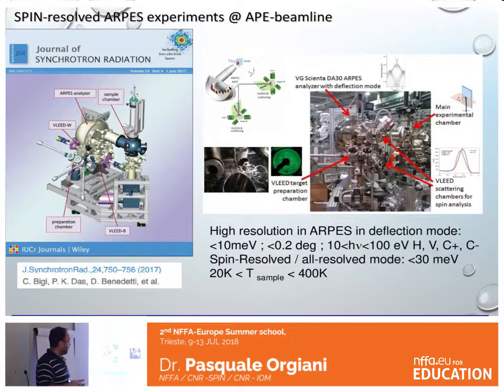So, but what about the surface state? So this is the bulk, so it's in the film. But what is the situation at the surface? To do that, we use ARPES, which stands for angle-resolved photoemission spectroscopy, which has the advantage of being very sensitive to the final layer of material. So it's perfect to investigate the surface state.